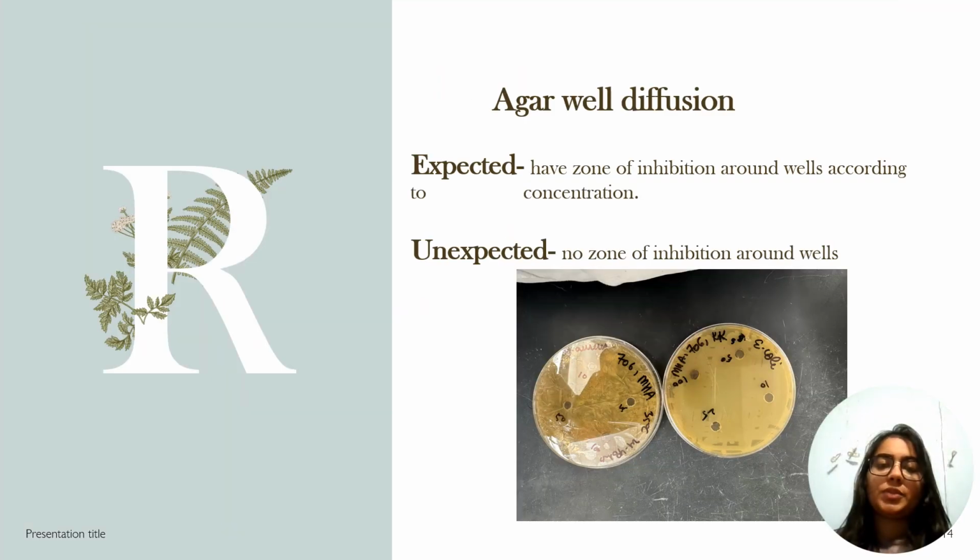For the agar-well diffusion method, MHA plates are used as MHA is a medium that supports the growth of non-fastidious bacteria and is also low in sulfonamides. The holes in 4 mm thick agar were made using a Pasteur pipette to pour different concentrations of beetroot into the wells. The plates were swabbed with the cultures of E. coli and S. aureus that were inoculated in nutrient broth 24 hours before swabbing on the agar plates.